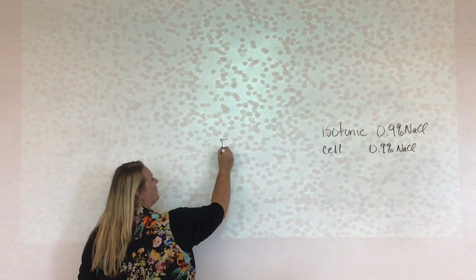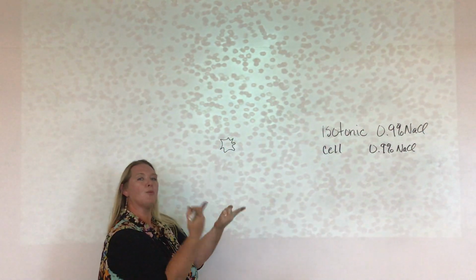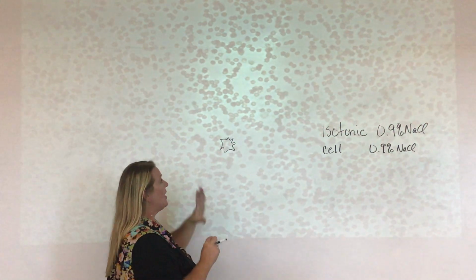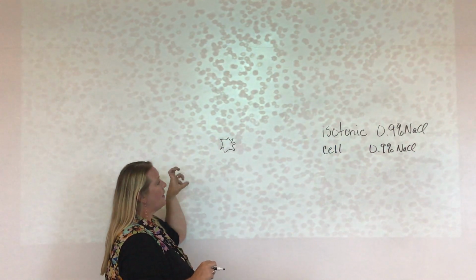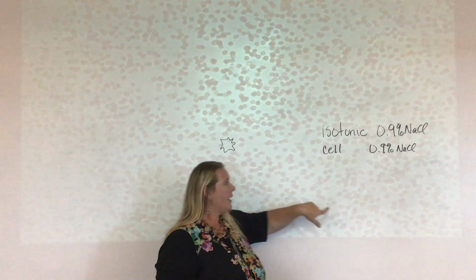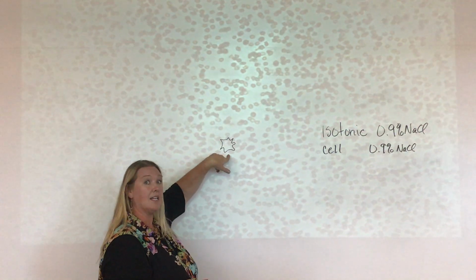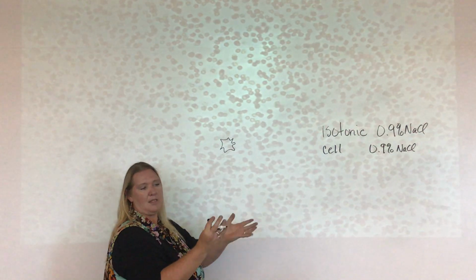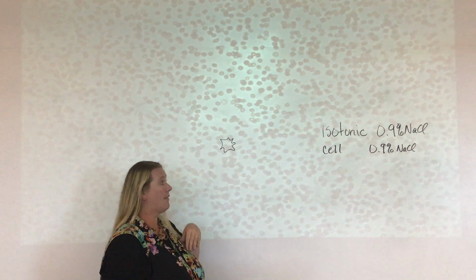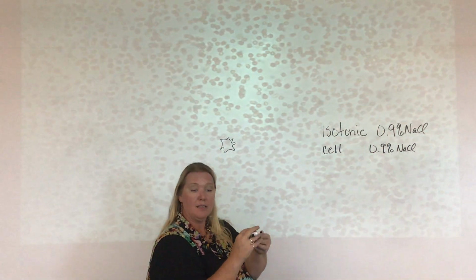Where they look a little starry shaped, where their edges aren't quite as smooth and round. They're not quite that nice plump jelly donut style of shape. And if we continue to watch, they would get smaller and smaller and smaller. You can also see where it looks like some of them are sticking together. Once the shape of that cell, and probably the size too, that membrane starts changing, they get a little bit sticky. They can stick to each other, they can stick to the blood vessels, different things like that. And so they'll start clumping or coagulating and clotting together, okay?